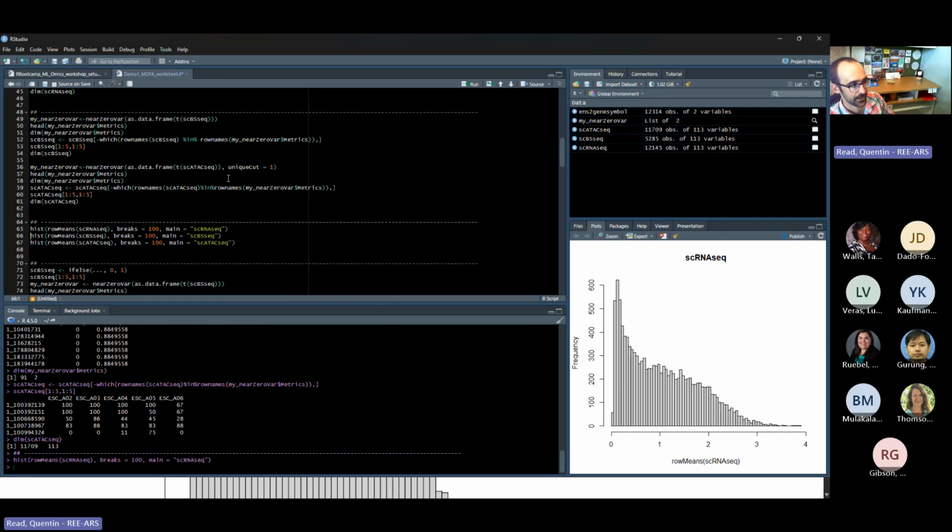So you can see that the RNA-seq data are more or less continuous. We have a decent number of low ones and a tail of highly expressed genes. And again, this is the log transformation that we did already on that. Let's look at the methylation one. So I'm going to run the next line for that one.